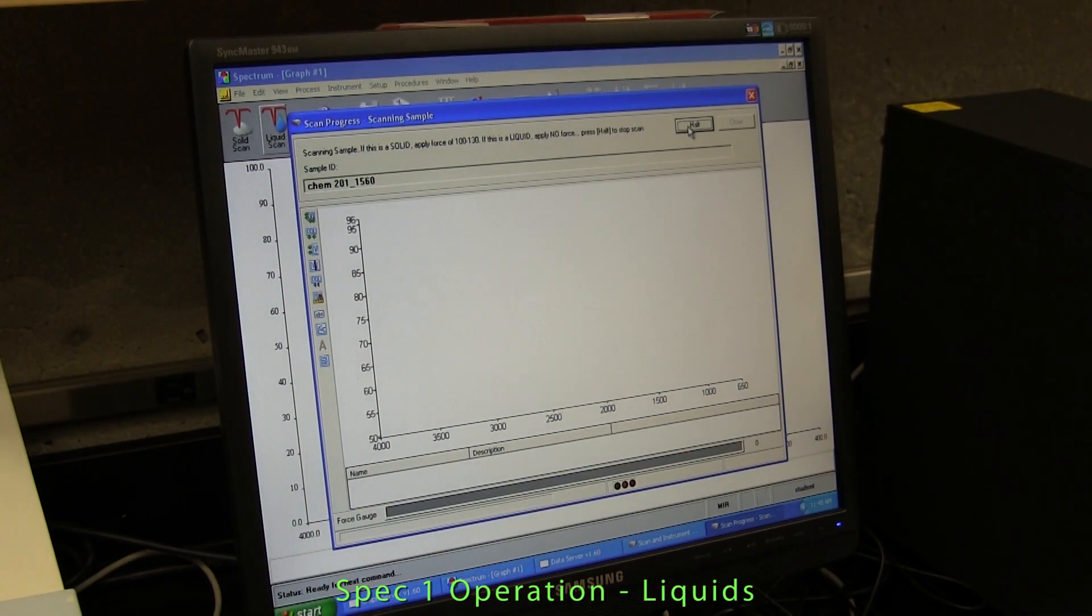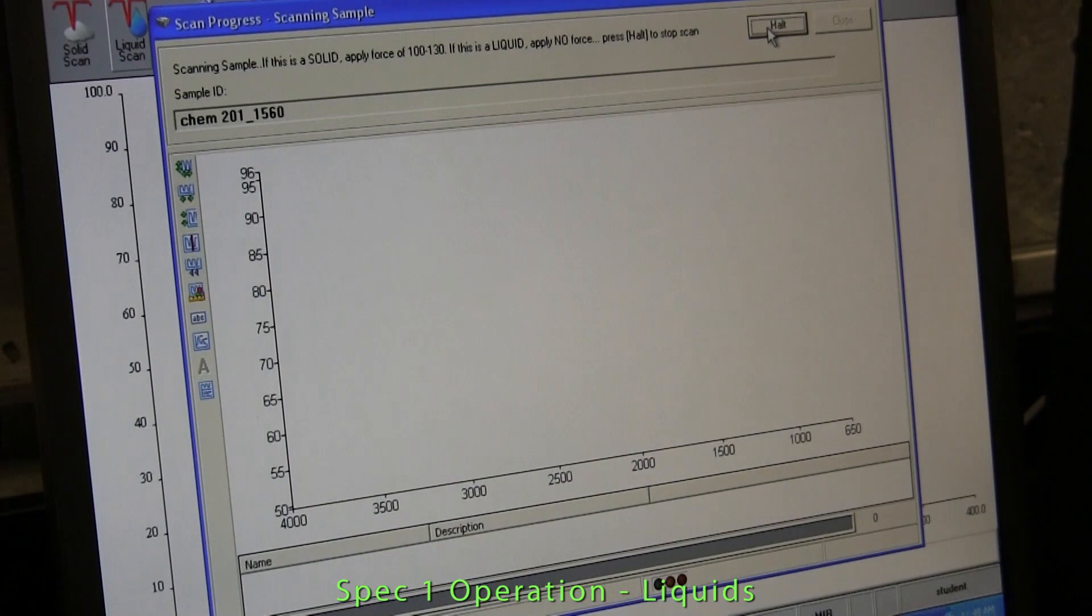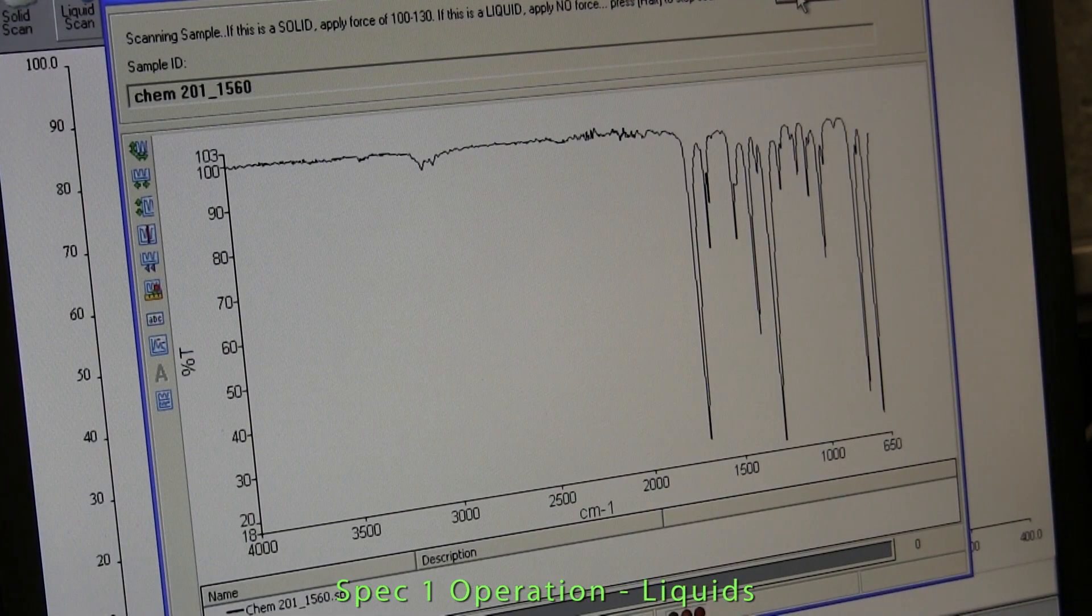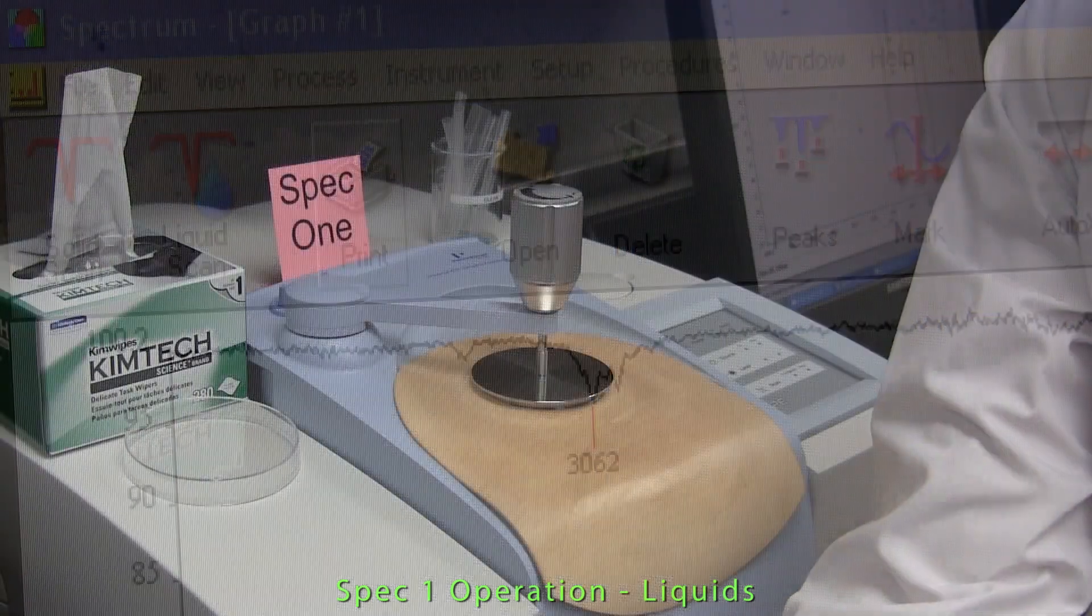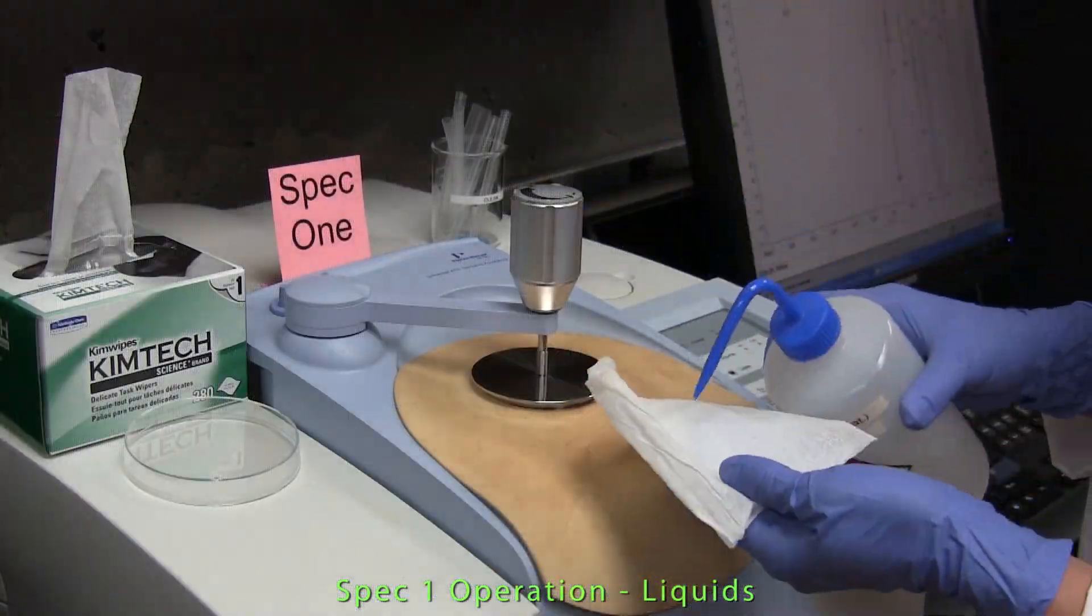Everything is the same as for a solid sample except no pressure is used with the liquid. A spectrum is obtained and printed out as usual. Cleanup is the same as it is for solids.